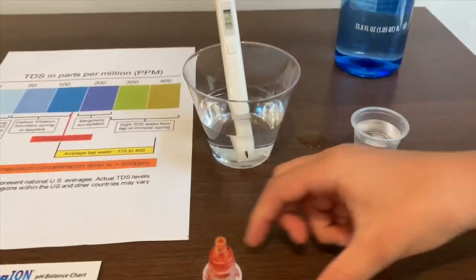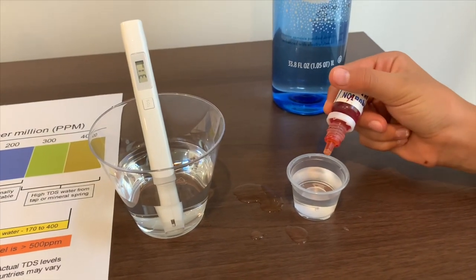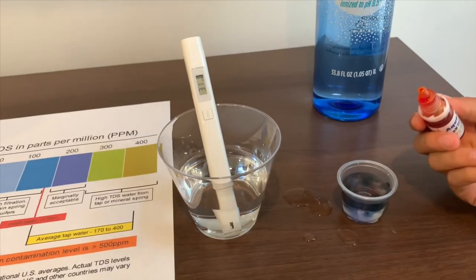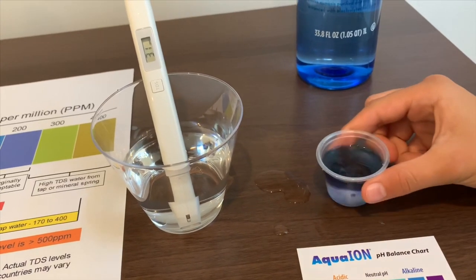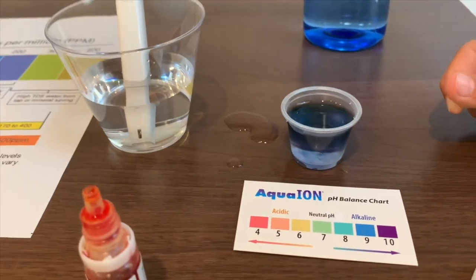Now let's see the pH level. It's close to 9, so that means it's alkaline water.